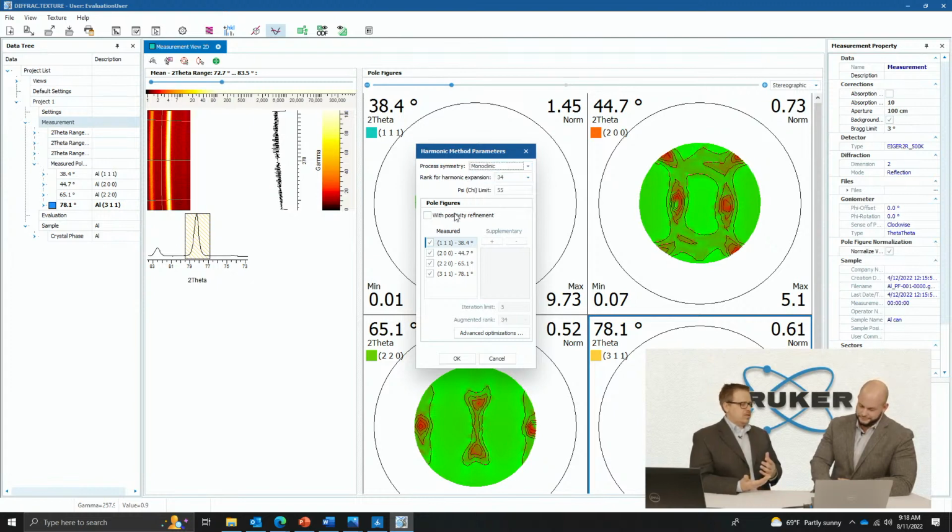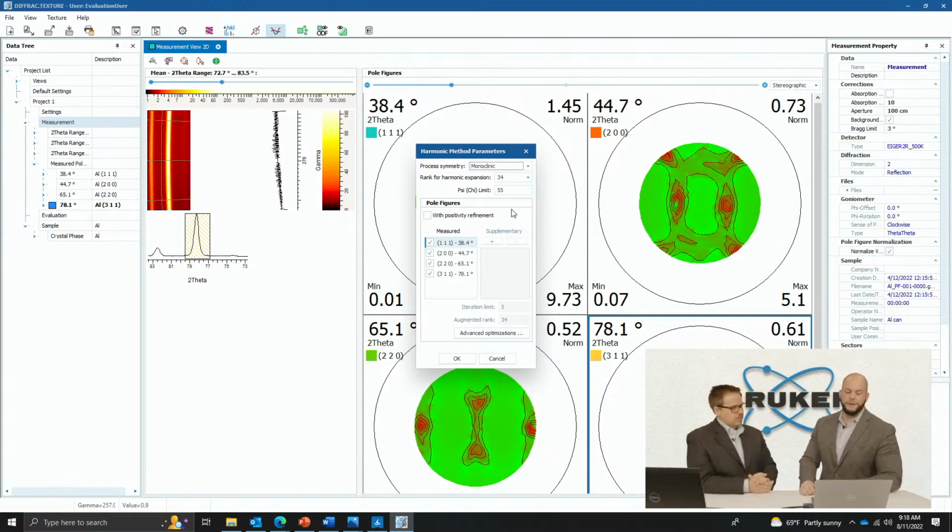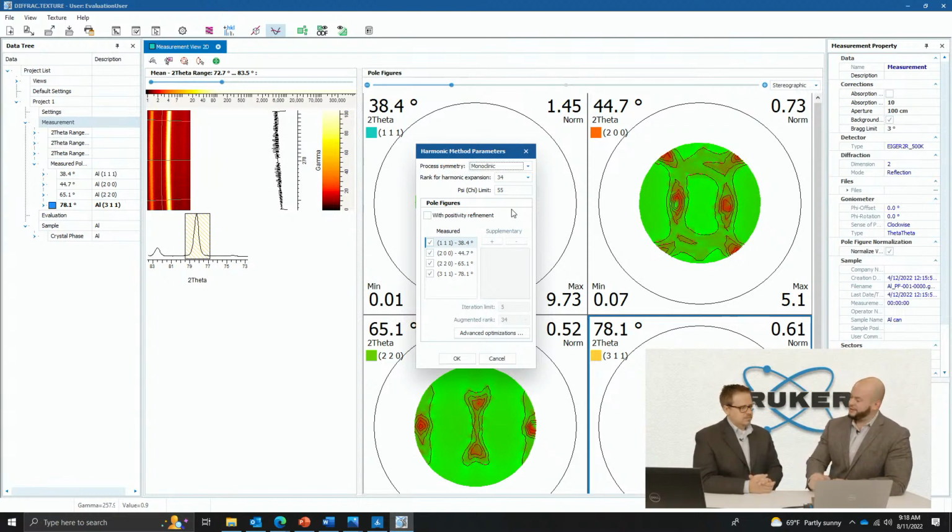So it's basically the symmetry in the graph, not the symmetry of the crystal. Correct. If we did triclinic, it's kind of a Hail Mary. Orthorhombic, on the other hand, means you look at it and go, you know what, it looks the same in all four quadrants. Exactly, and that's going to lock it down a little bit. So it just has to do with the symmetry of the system, and it's very easy to play around with and demonstrate. You'll see it in the calculated pole figures.